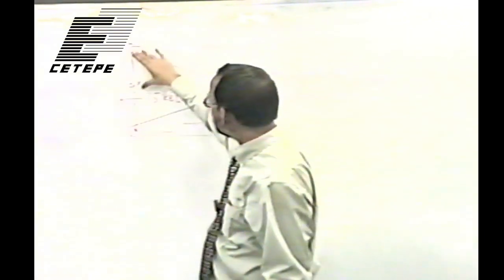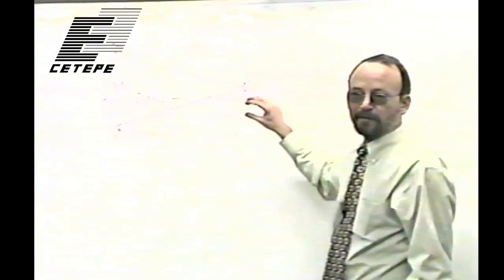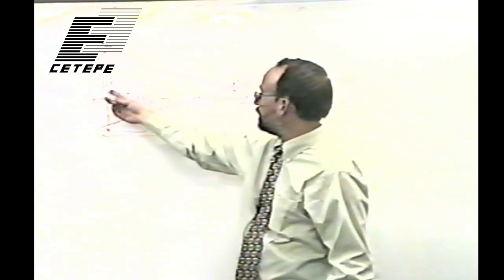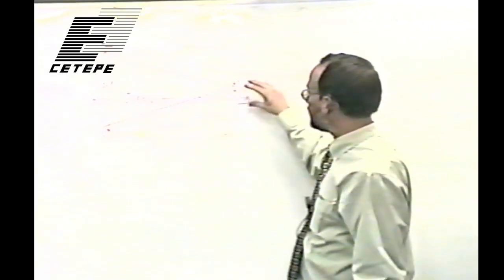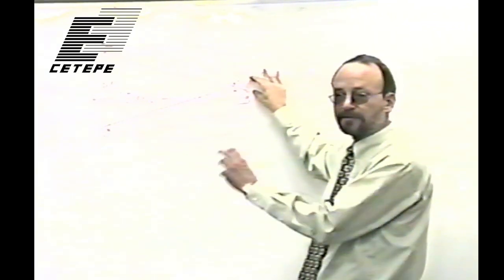But anyway, it takes a large format image on the front, maybe 9 inches, and demagnifies it or minifies it to a small output window, usually about 1 inch. So right there you have a gain that's proportional to the areas, the ratio of the areas. So you'd have 4.5 squared over 1 squared. So that's about whatever that is. I can't do it in my head, but anyway, there's that gain due to the small area. You're putting all the quanta onto a smaller area.